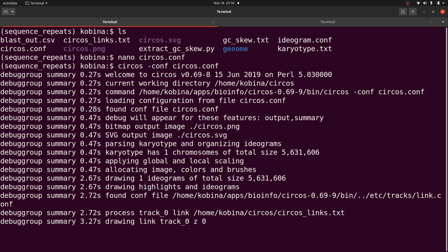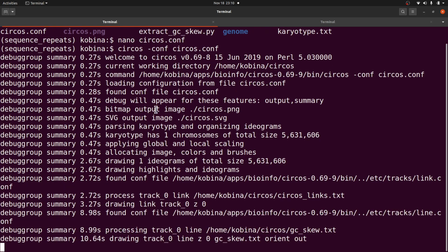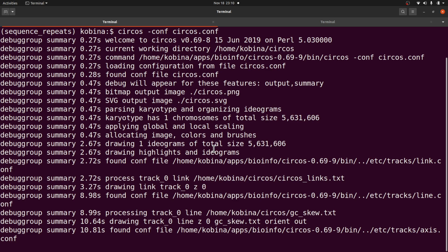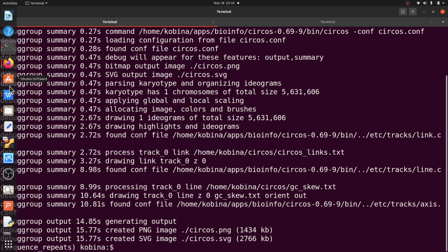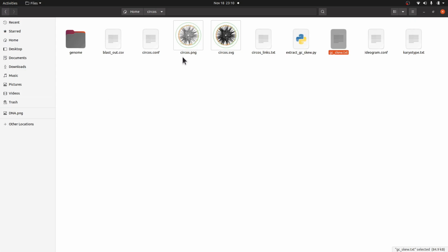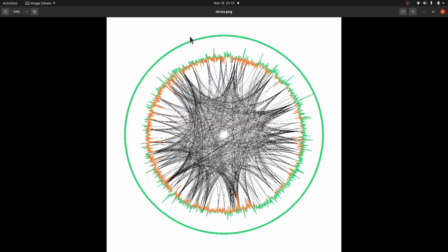Now let's see how it goes. This should be done very soon. I think it's even done now. Yes, it's done. So you can come back and then view and open it. Now you can see some changes. What we have is orange, and we have green. So now at least we are able to distinguish between positive and negative values. That's how we do it.